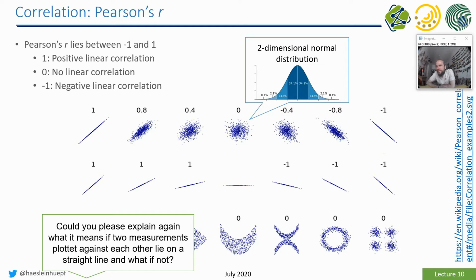As soon as this factor does not allow it anymore, there is some variation coming from some other source, so it's non-linear, then we come to distributions of points which are not lying on a line anymore, or may have whatever other shape.